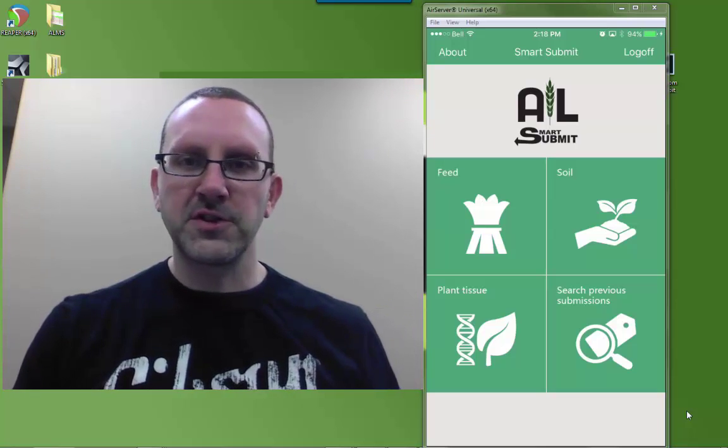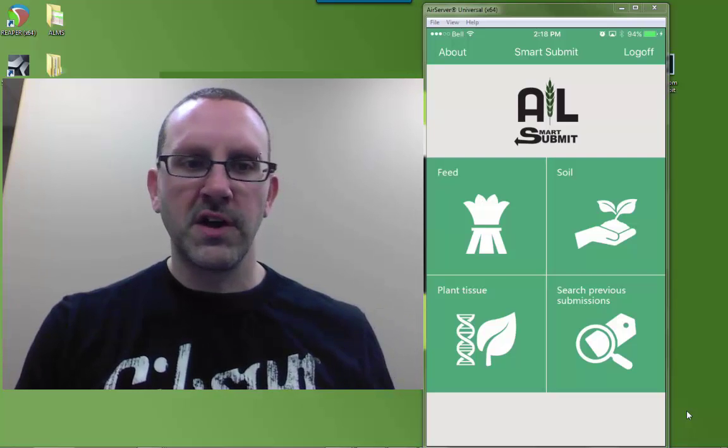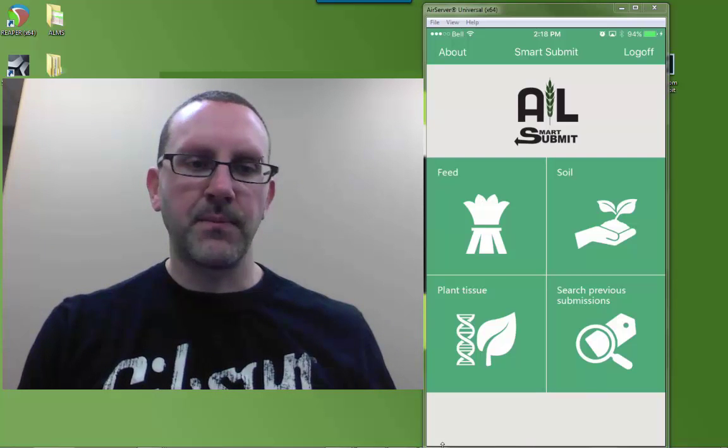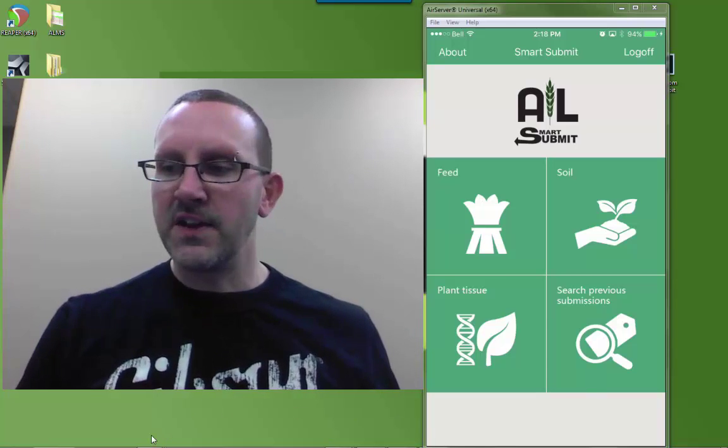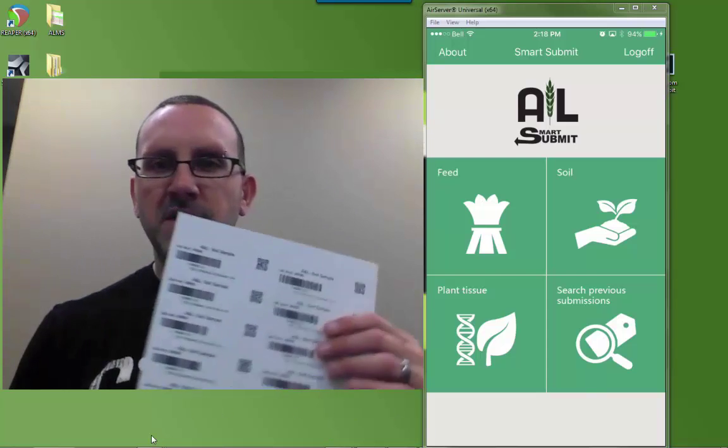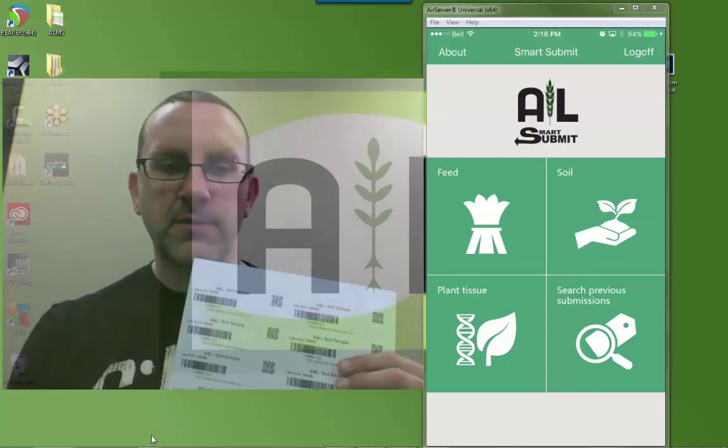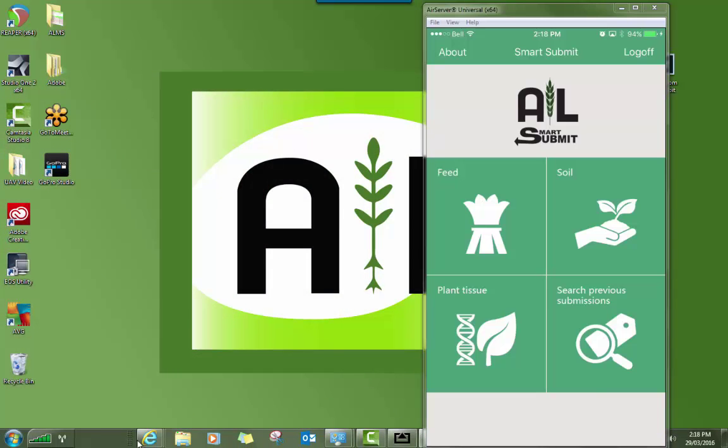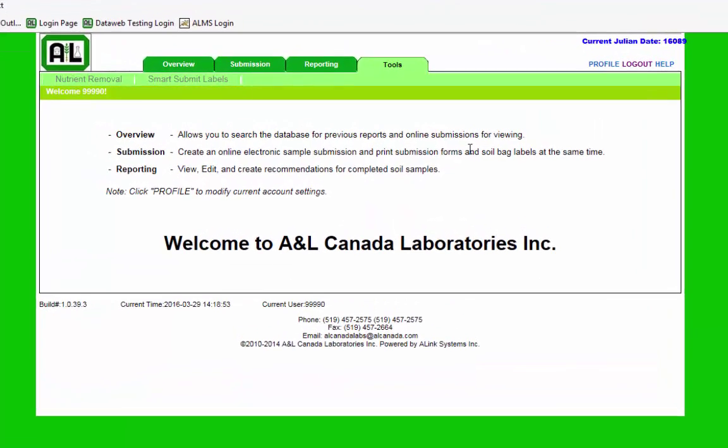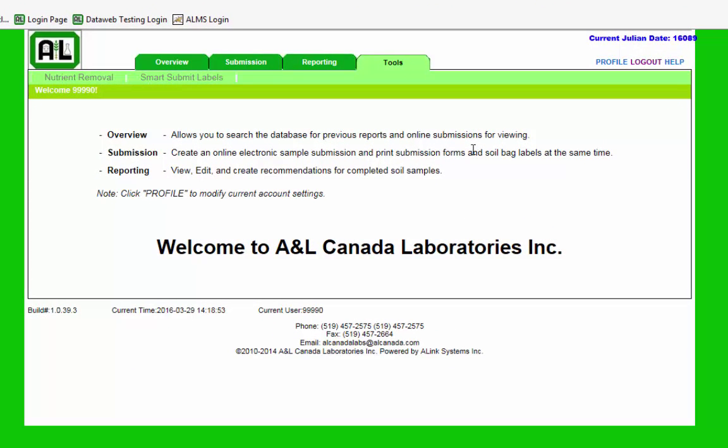So first thing we'll do is I'll talk to you about creating these labels from the DataWeb. The first step will be to log into the DataWeb. If you don't have a username or account number for the DataWeb, please give the lab a call and they'll set you up with that.